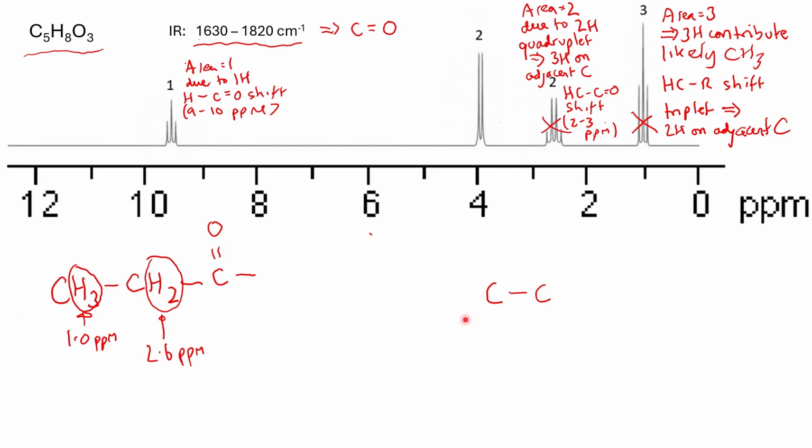When you have a peak between 9 and 10, that's different, because that means you have this H bonded to a carbon, and then the oxygen is directly bonded to that same carbon. So you have that in your structure. So HCO. And that's what the chemical shift of that tells us. So that's a huge advance because we now know this compound has an aldehyde group in it.